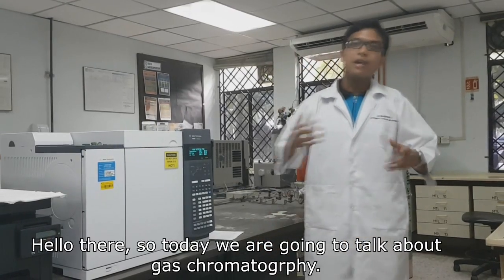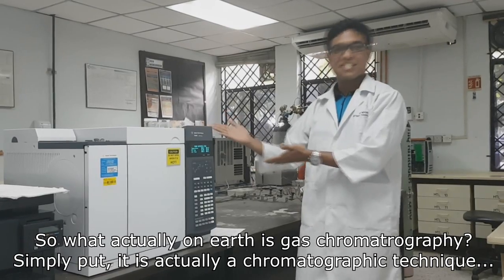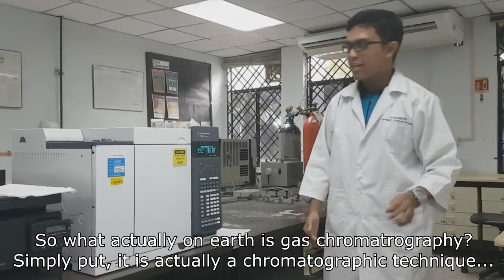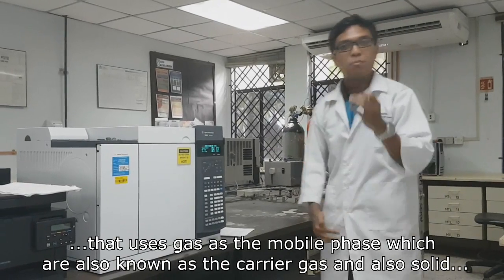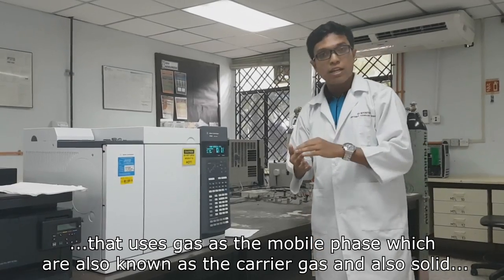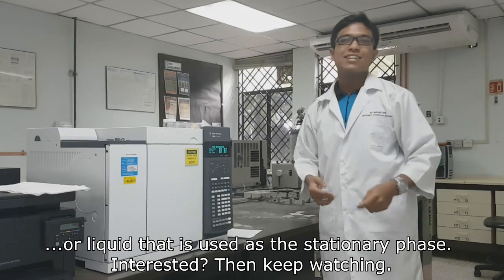Hello there, so today we are going to talk about gas chromatography. So what on earth is gas chromatography? Simply put, it's a chromatographic technique that uses gas as the mobile phase, which is also known as the carrier gas, and a solid or liquid that is used as the stationary phase. Interested? Then keep watching.